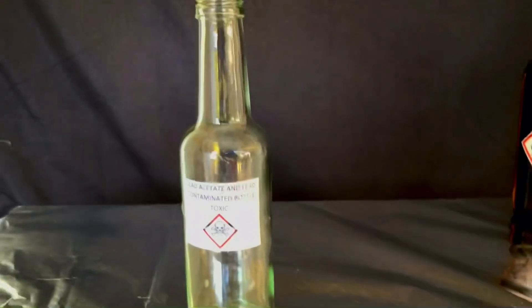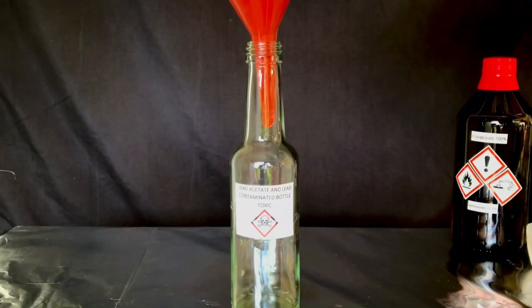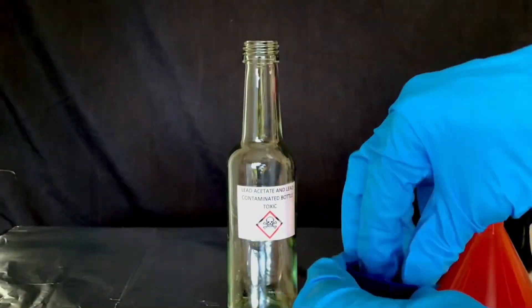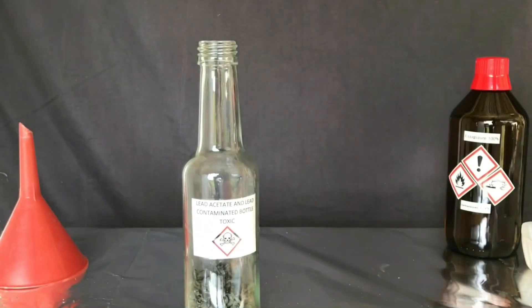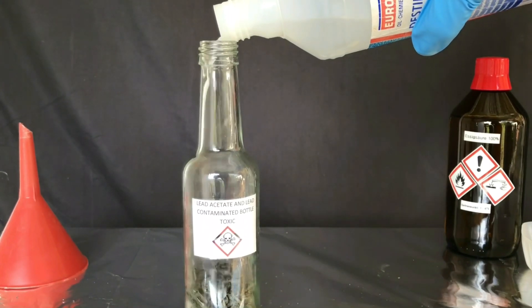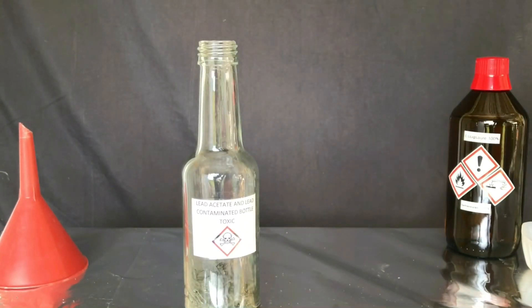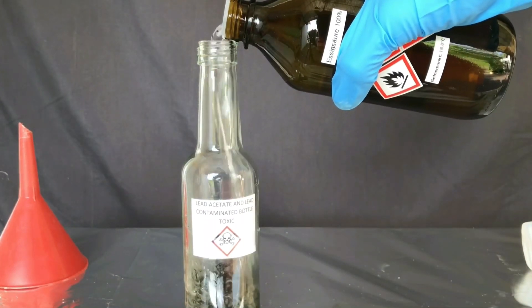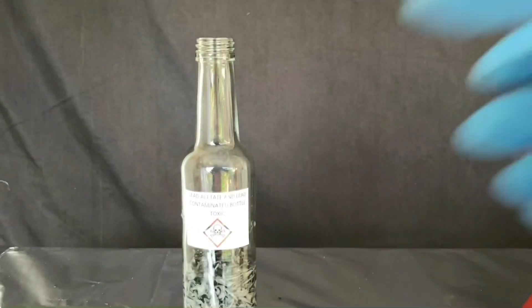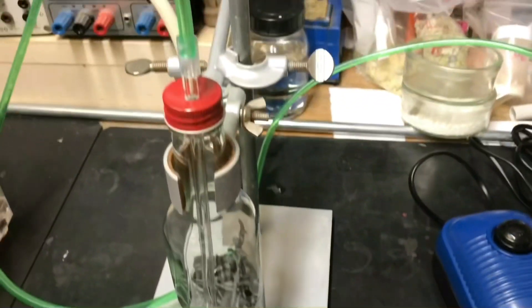We are going to build a makeshift gas washing bottle for our reaction flask. A lot of chunks of lead metal were added to the glass bottle, followed by distilled water and glacial acetic acid. Normally only lead-grade glass should be used for experiments, but I didn't want to contaminate my gas bubbler with any soluble lead compound, so we went this route. A glass tube going through the lid was placed into the lead metal, reaching all the way to the bottom of the bottle, then connected to an aquarium air pump.